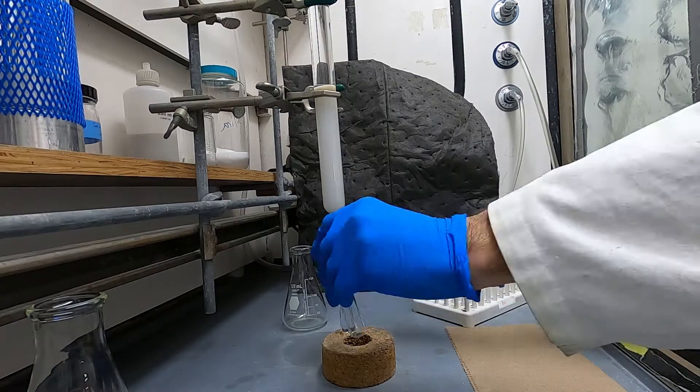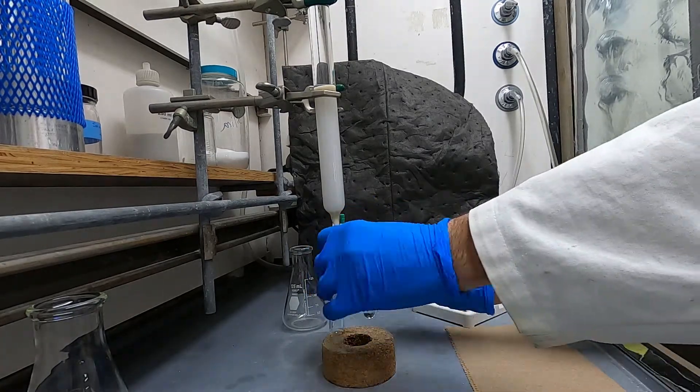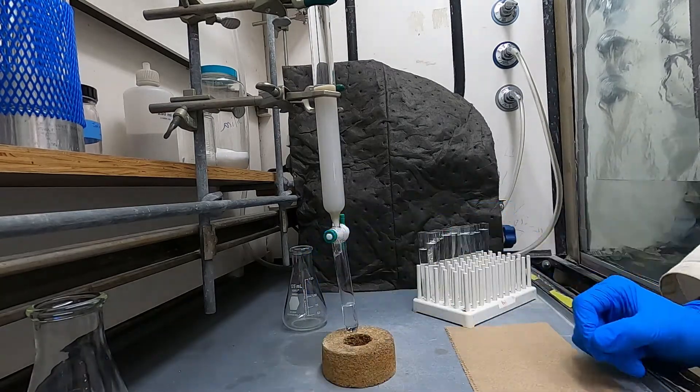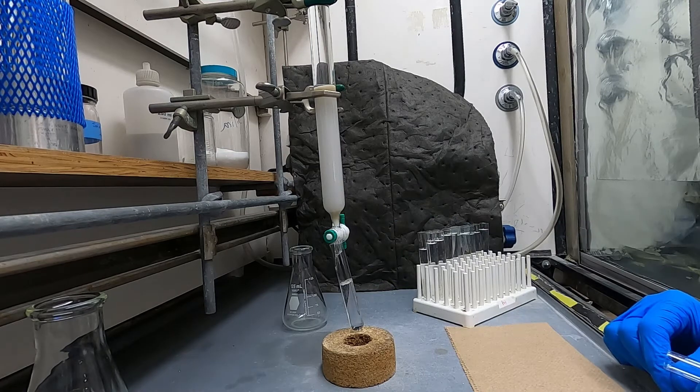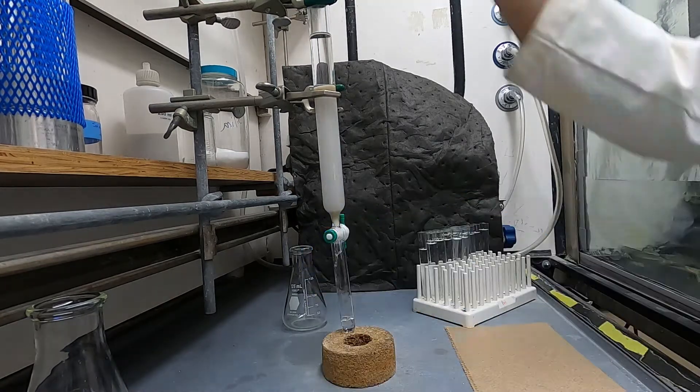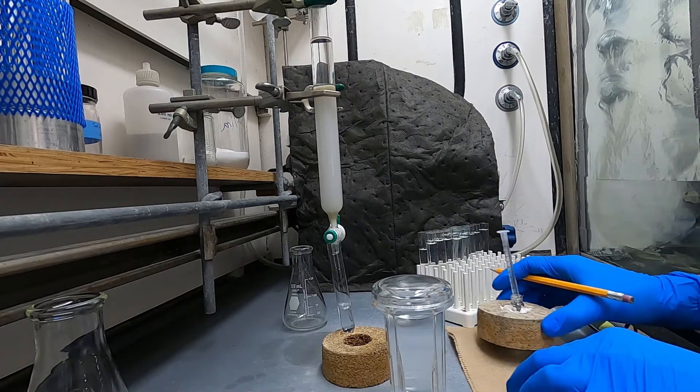Yeah so while you're collecting fractions you'll just want to choose the fraction size that is appropriate for what you're doing. If you're isolating hundreds of milligrams or even grams of something you might want to use a bigger column fraction size because you're going to be using a bigger column.